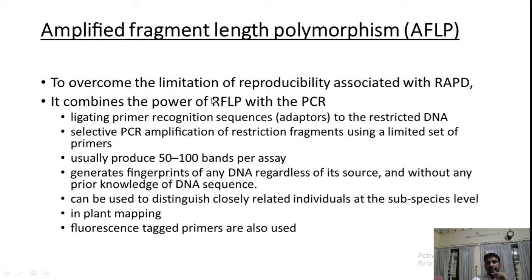In the second case, that is in the case of RFLP, here we require a lot of sample DNA to work with. That's why we are much more interested in AFLP.